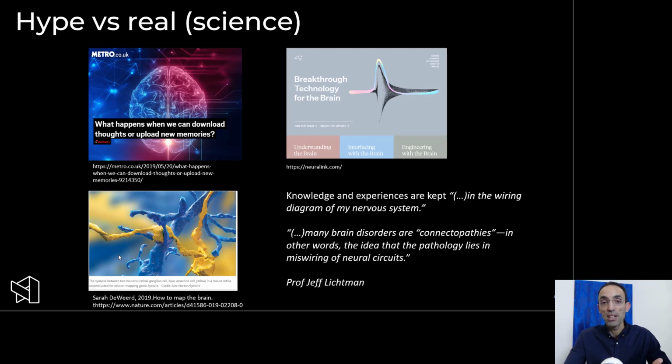On the one hand, detecting and knowing the map of the brain, essentially where all the cells are, how they connect to each other, and understand the motifs that describe these connections, can help in two ways.